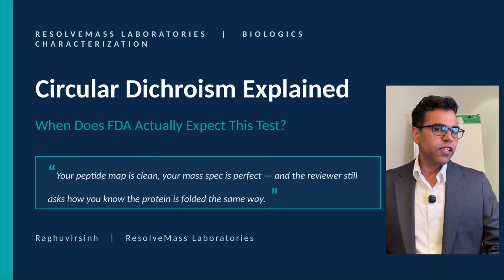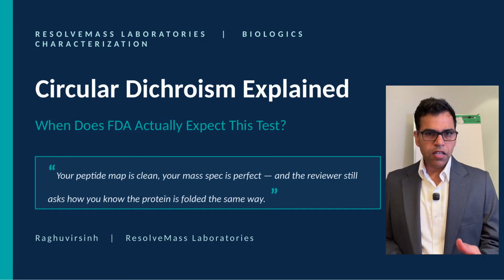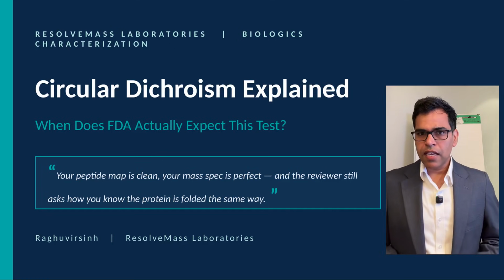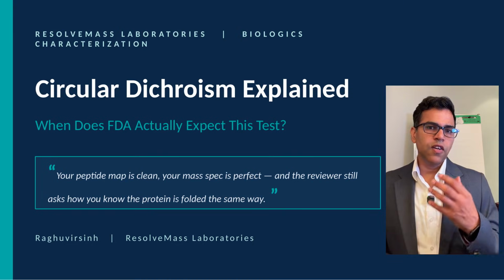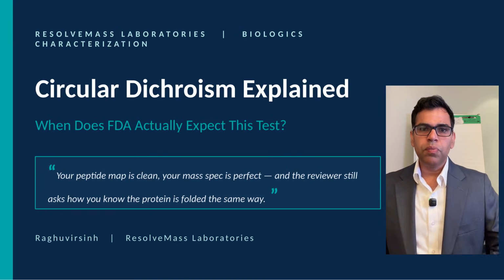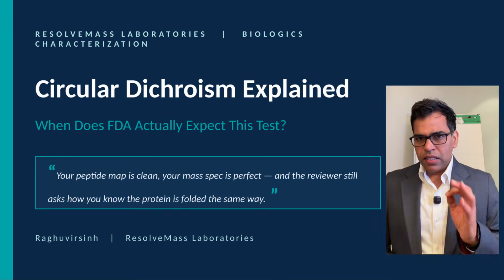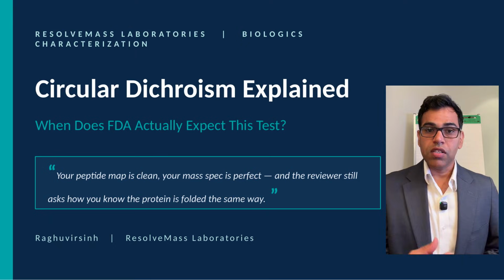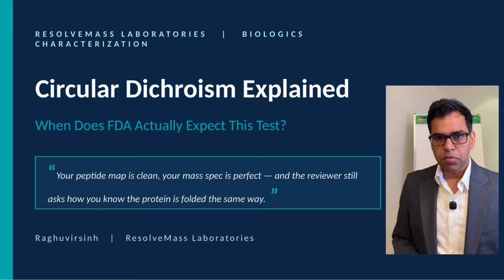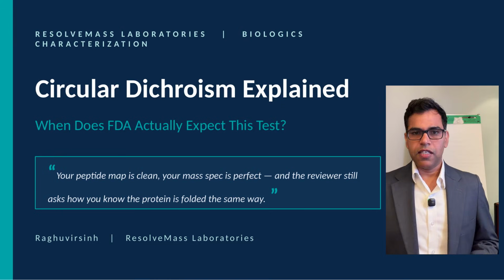18 months of analytical data, a clean peptide map, mass specs down to the individual glycan, and the regulator still comes back asking one thing: how do you know the protein is folded the same way? This is the question circular dichroism exists to answer, and most teams learn it was expected only after somebody asked.